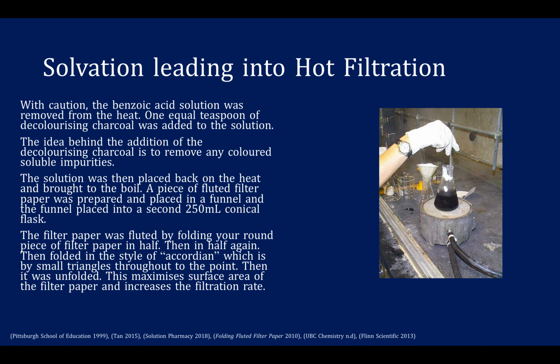Leading into hot filtration from solvation. With caution, the benzoic acid solution was removed from the heat. 1 equal teaspoon of decolorizing charcoal was added to the solution. Now, the idea behind the addition of the decolorizing charcoal is to remove any colored soluble impurities. The solution was then placed back on the heat and brought to the boil.